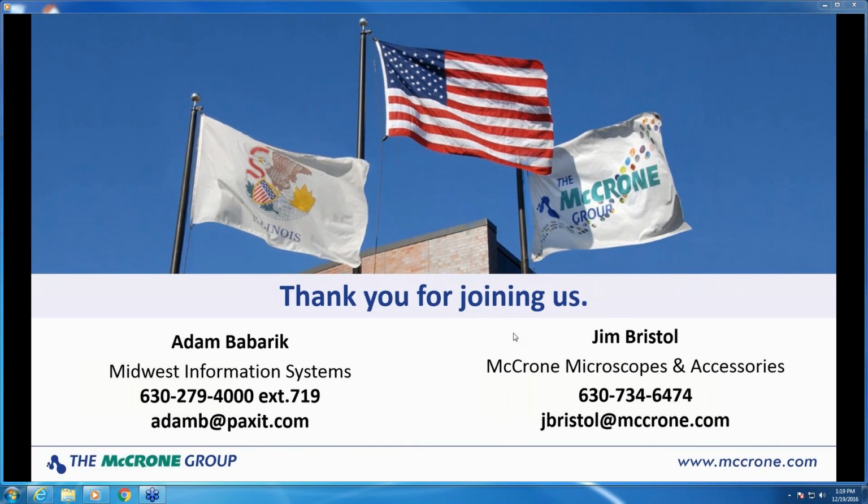And again, just to reiterate, you're not limited. Many clients that we've dealt with, especially internationally, have such various applications, and each one of them, even among labs doing the same exact thing, perhaps want to do it in a different way.